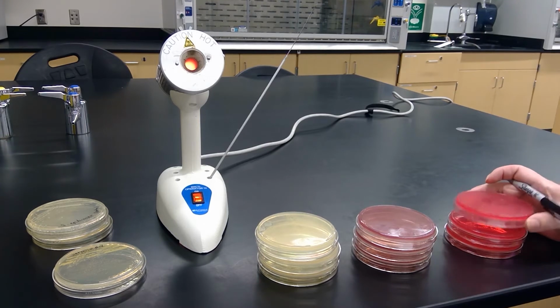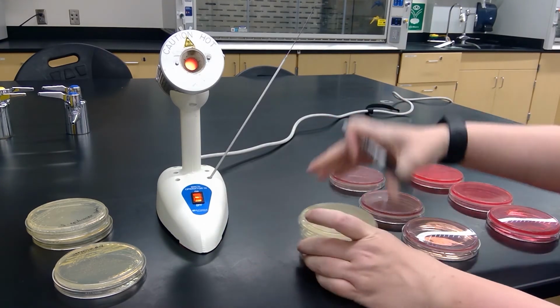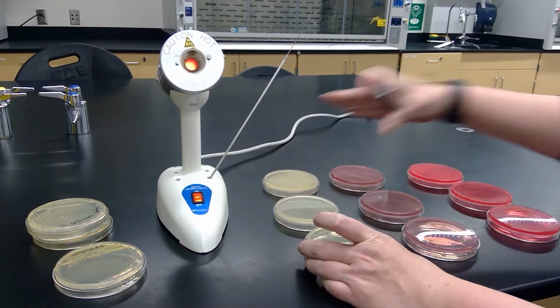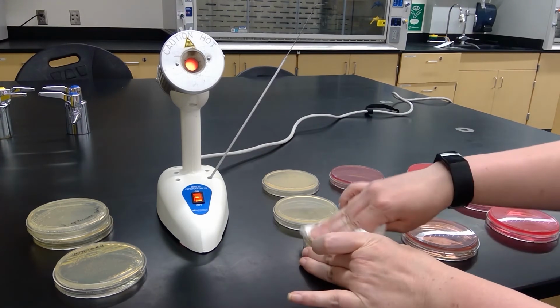It's also good to just let these air dry because otherwise it's kind of hard to write on them. So I'm just gonna use a paper towel to remove any moisture.